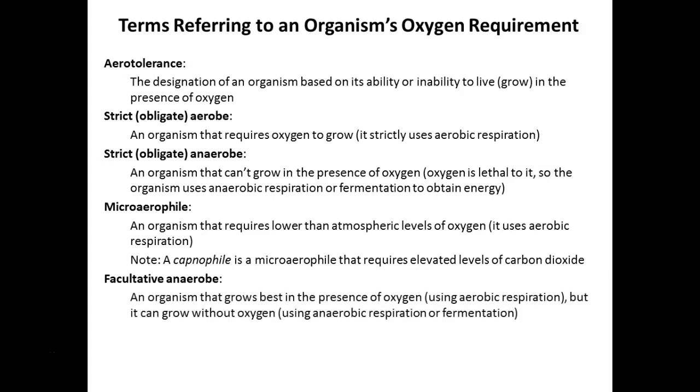So a lot of you guys have facultative anaerobes. And then one of you guys has our aerotolerant anaerobe. So how is it growing? How is it respiring? Anaerobe. They're an anaerobe, right? No oxygen. So they're probably doing fermentation.